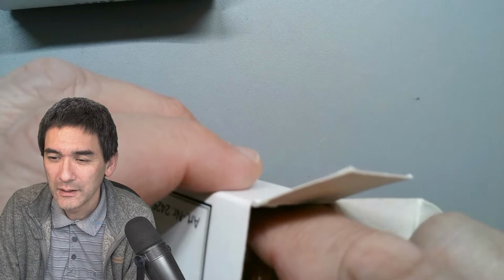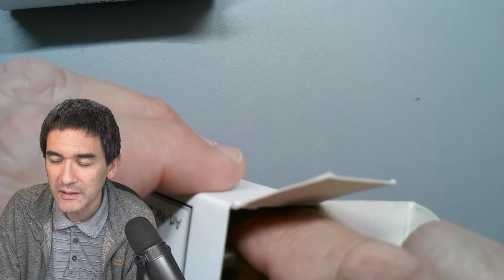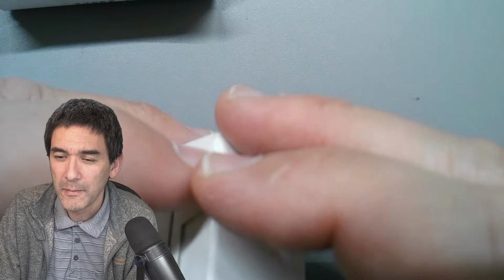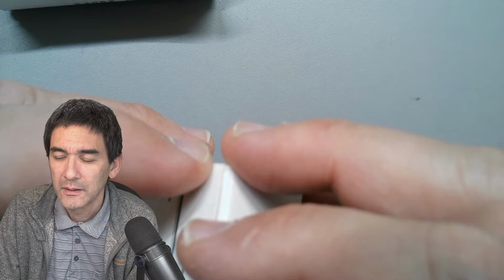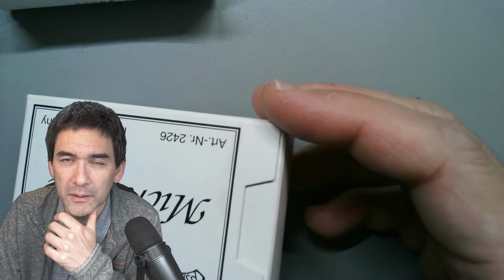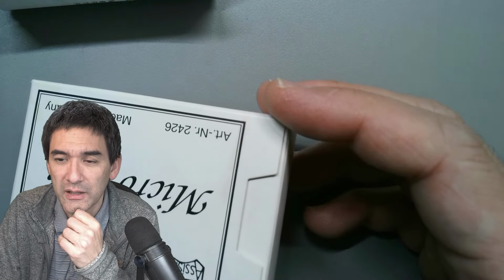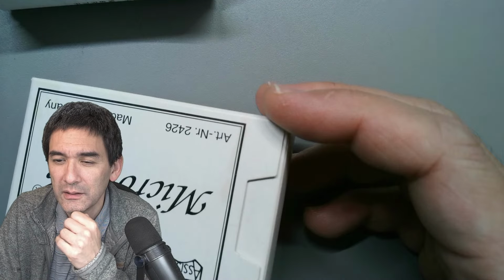Okay. Glycerin from all sides to cover slips, and cyanobacteria inside makes the job. The cyanobacteria do the photosynthesis. And the glycerin, or what you can do is maybe not just glycerin, but petroleum jelly. This is Vaseline. Vaseline also can be used. Yeah. Okay.